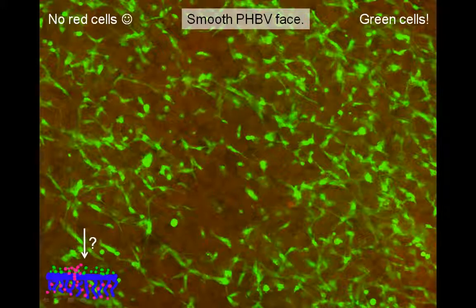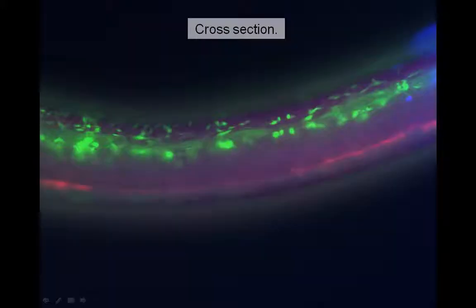And just to show you a cross section through this, you can see roughly in blue the scaffold. You've got this red halo of HSMPs on the far side, and this green fluorescence of the fibroblasts on the opposing side. There's no green cells on the red side, no red cells on the green side. The barrier has been effective at 7 days.